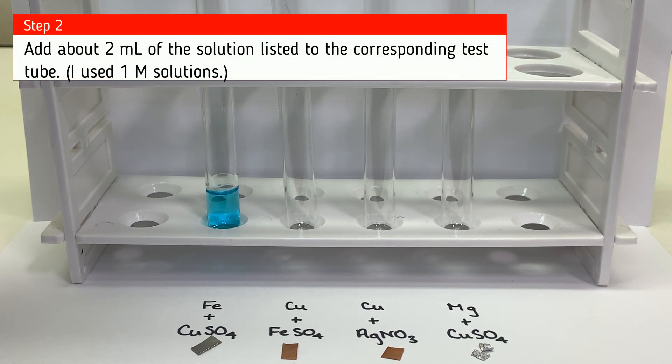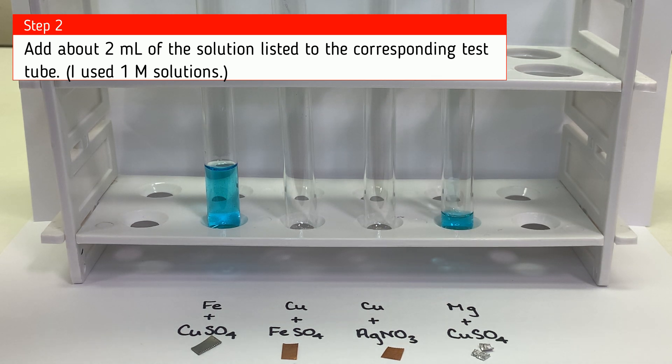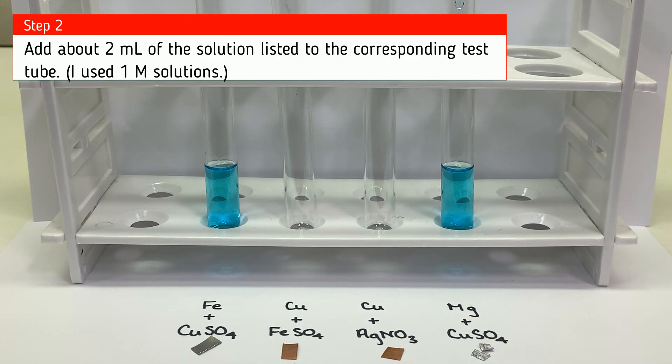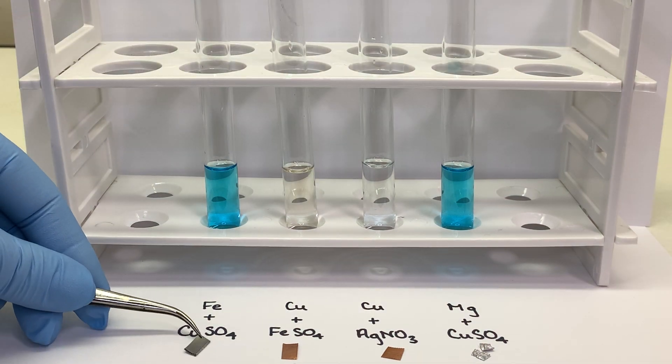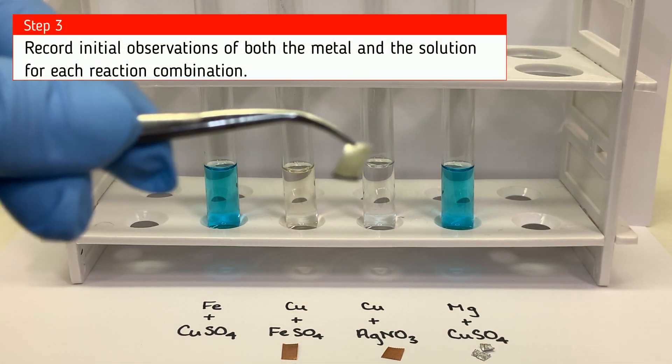We will be combining a small amount of each of the metals with about 2 milliliters of the solution listed. So as I'm preparing my ingredients here, you should be creating a data table where you can record your observations of the metal and the solution separately before the reaction takes place. Then create a data table where you record your observations of each mixture both 15 minutes and 30 minutes after the reaction takes place.